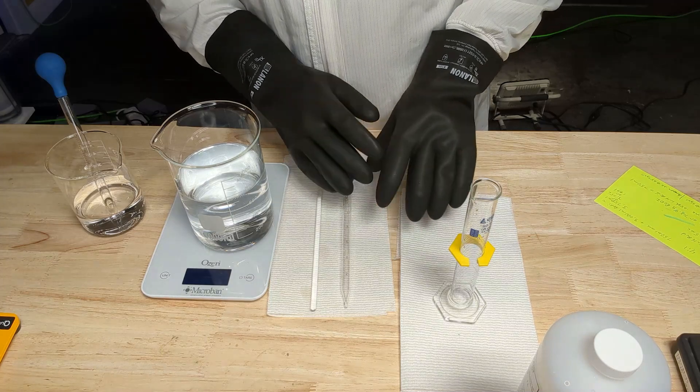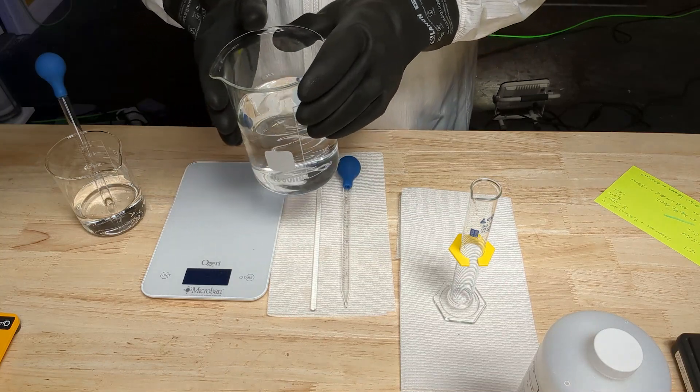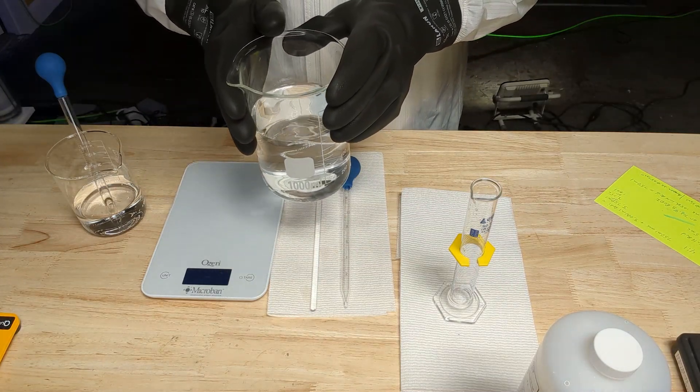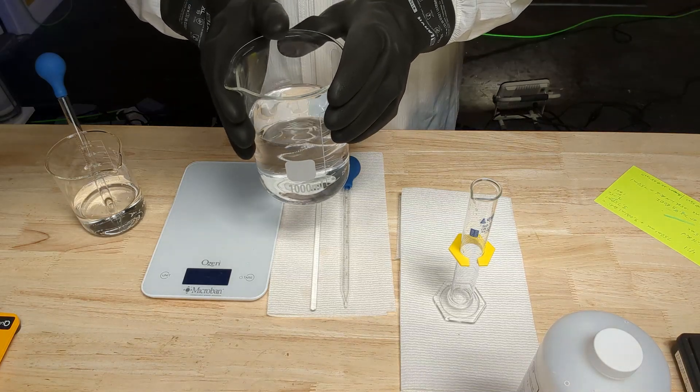I'm going to properly rinse and clean these off, then dispose of anything with my gloves on. Now we're ready for the second half, which is diluting this 0.05 molar concentration down — the actual reagent is a 0.01 molar concentration.